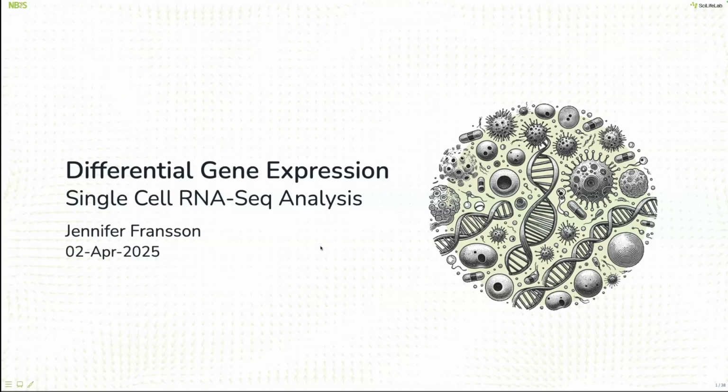Okay, so differential gene expression. I'm sure you're all familiar with the concept already, but there are a lot of things to consider when you do differential gene expression in single cell compared to bulk.